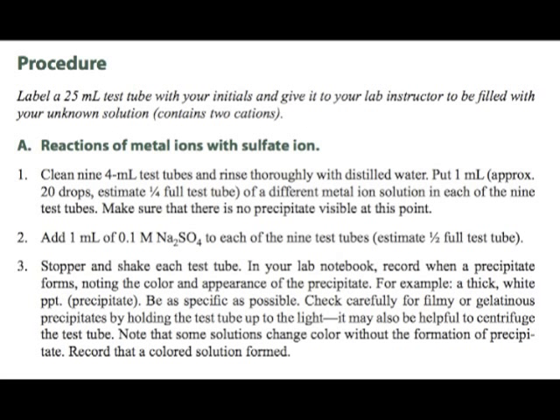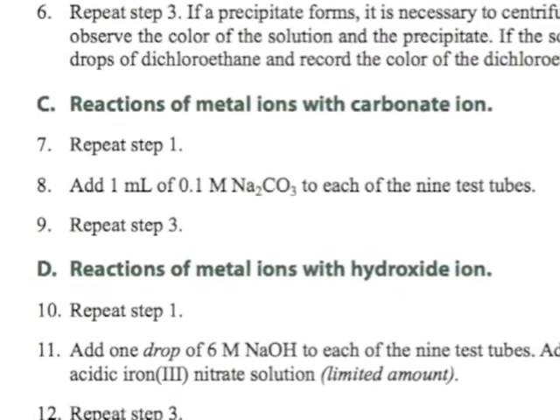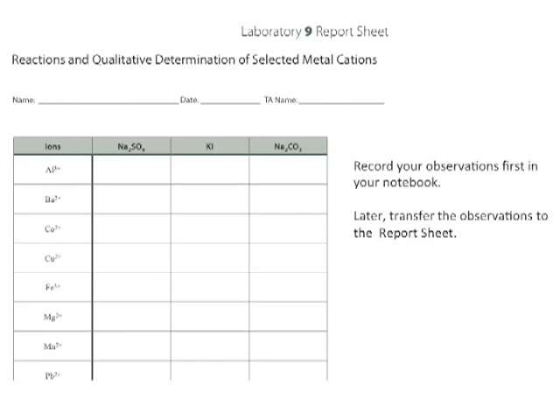Notice that you will begin your analysis by examining reactions involving sulfate ions. You will then move on to reactions involving carbonate ions, hydroxide ions, etc. Record your observations first in your notebook. Later, transfer the observations to the report sheet.